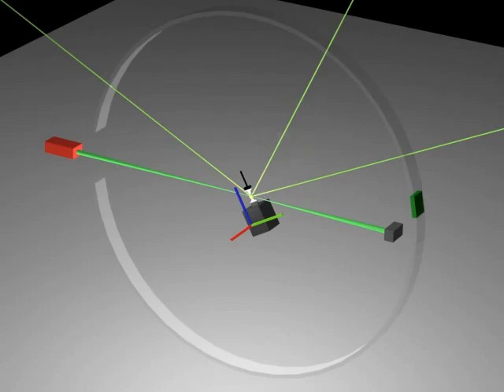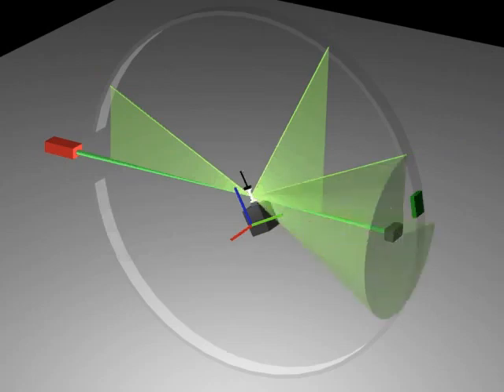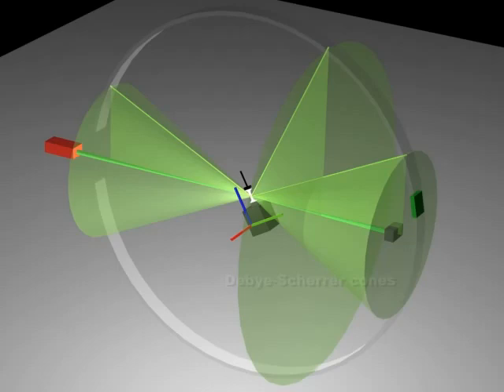When the number of crystals illuminated in a texture-free polycrystalline sample is large, the diffracted beams are distributed axisymmetrically about the incident beam. This scenario is referred to as powder diffraction, and the resulting cones of radiation are referred to as Debye-Scherrer cones. Preferred orientation among the grains in the diffraction volume is manifest as a non-uniform distribution of intensity along the azimuth of the Debye-Scherrer cones. Simply put, where there are more crystals diffracting simultaneously, the signal is more intense.